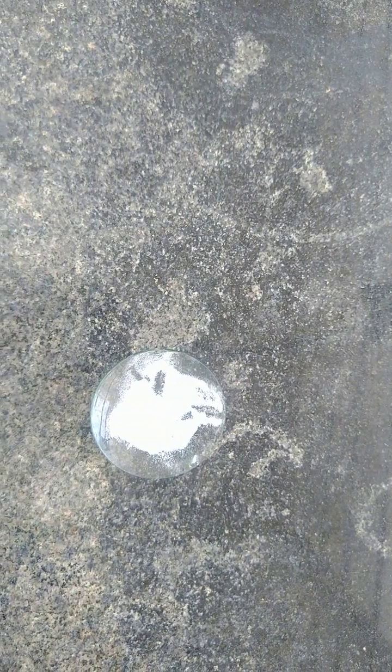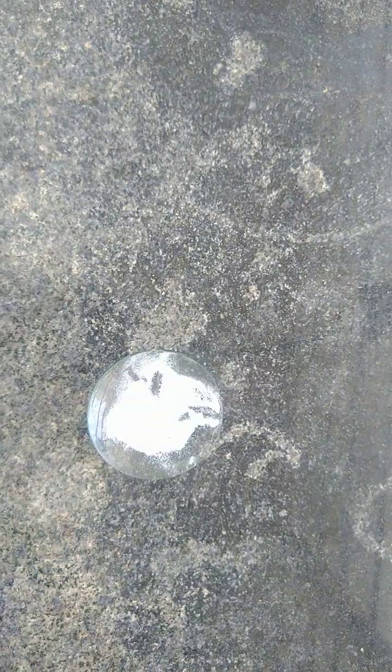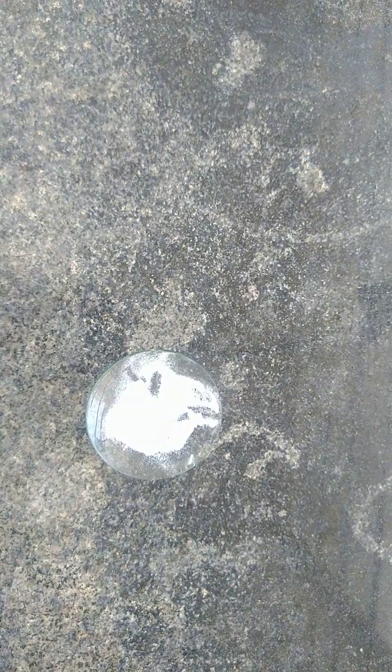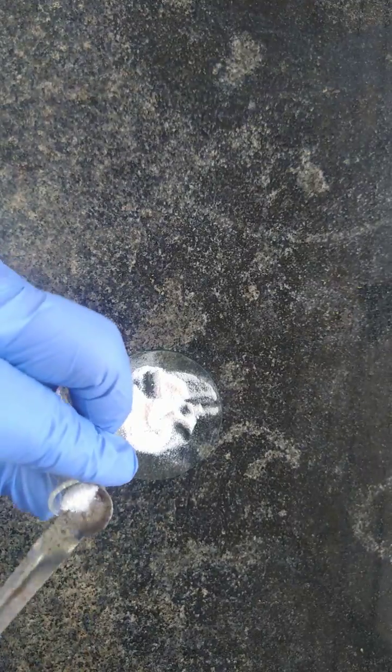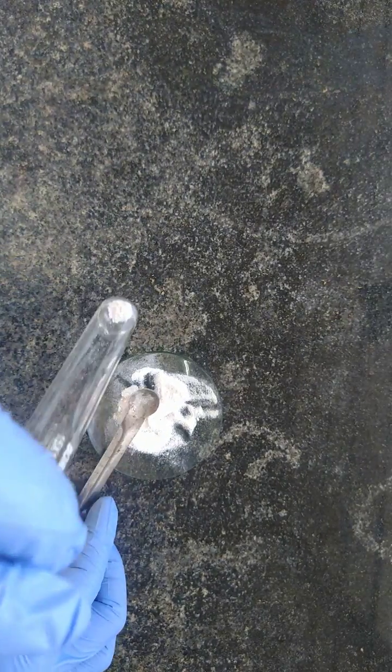Then we will go for detection of the basic radical group, and we will start with analysis of zero group radical, that is ammonium, and the test we are going to perform is salt plus NaOH solution and then boil. So I am taking a small quantity of salt in the test tube.